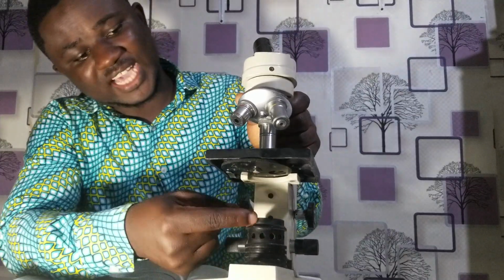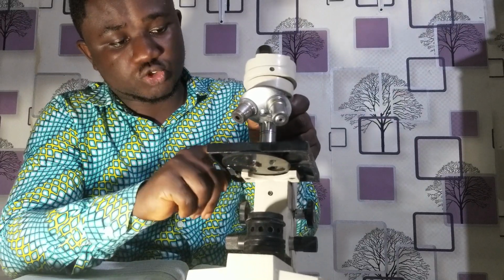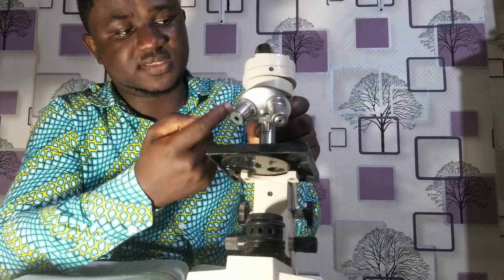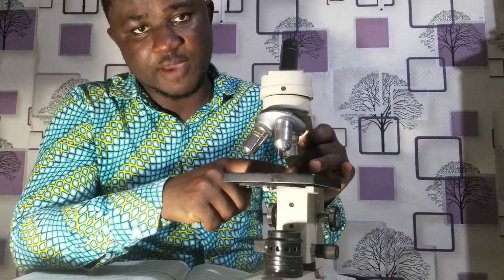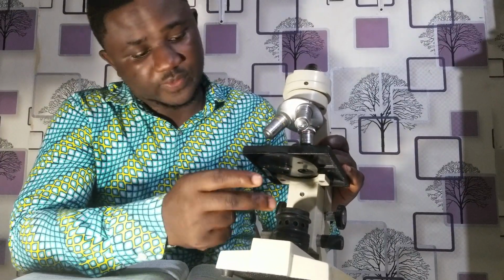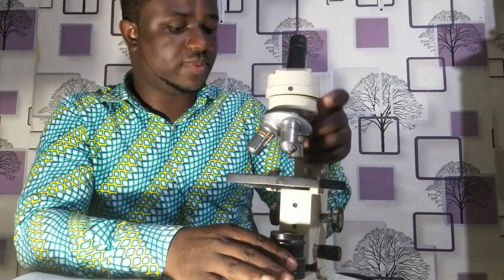So the light ray is coming from this source, this is the light source. Light passes through the diaphragm, allowing the light to pass through, then gets through the condenser lens and comes through to the objective lens, which picks it up, the image is formed, and afterwards you see it in the eyepiece lens. So once again, I've talked about the eyepiece lens, the objective lenses, the condenser lens, the diaphragm just beneath the stage, and then the light source. So these are basically the parts of the microscope that you need to know.